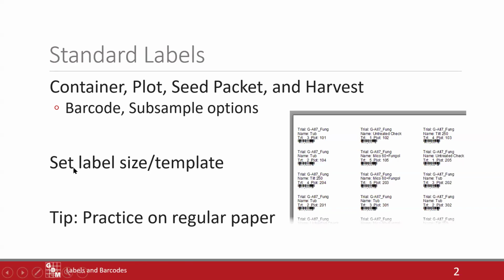All right, back here. So we kind of covered the standard labels here, I believe. I didn't forget to mention that the regular paper example, to try not to waste those label sheets, is a good way to do it, especially at least that first time through.